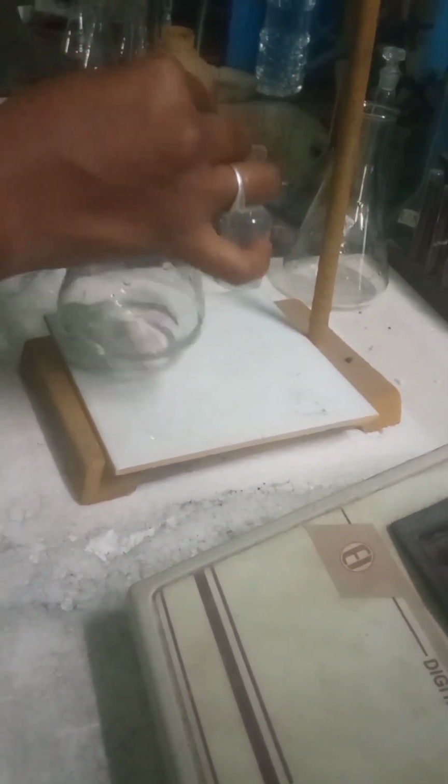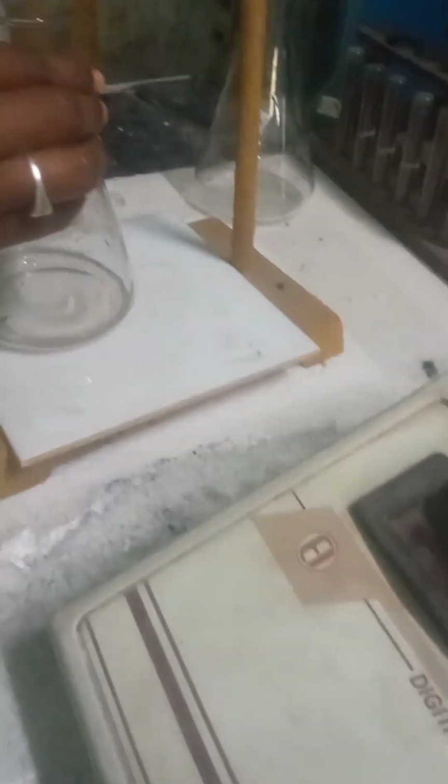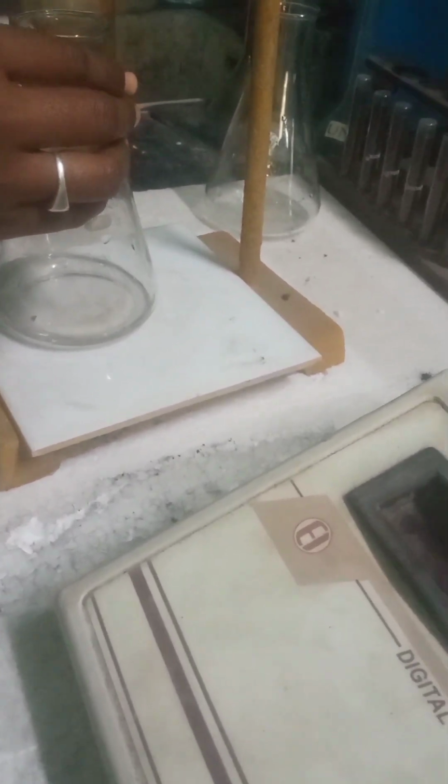This experiment was performed by first year BSc chemistry major students of this college. And finally, they have proved that the Freundlich adsorption isotherm has justification.